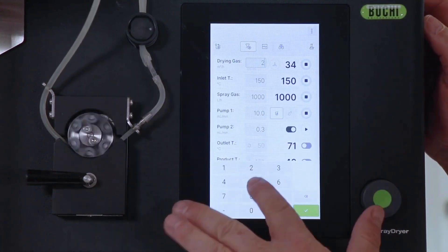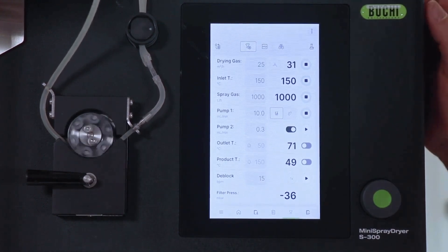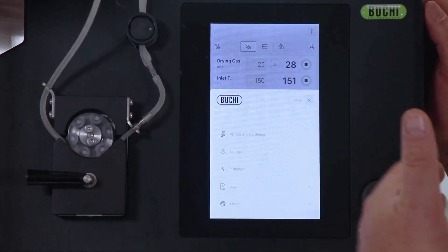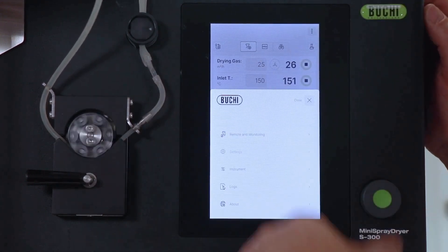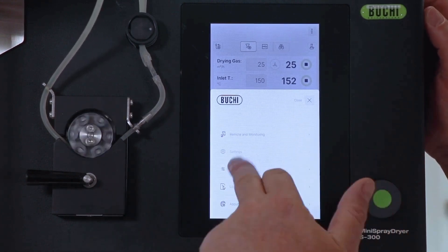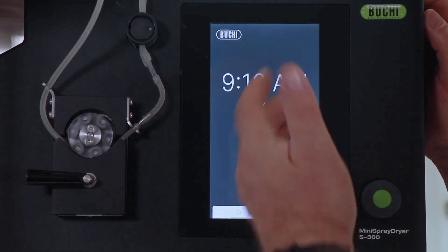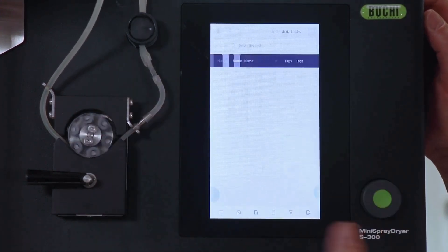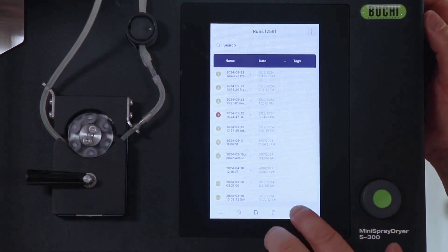Other screens include some remote monitoring options and setting options — during a spray drying process it is not possible to access these. Then we have instrument settings, locks, and about. We can navigate back to the home screen, the method screen, the job list screen, and the report screen at the end.